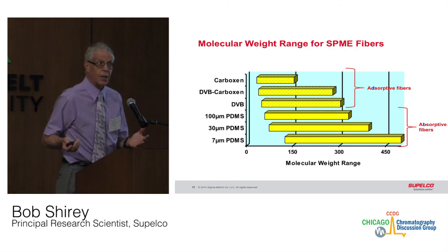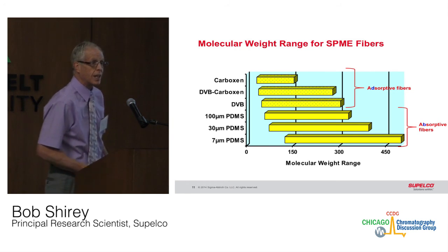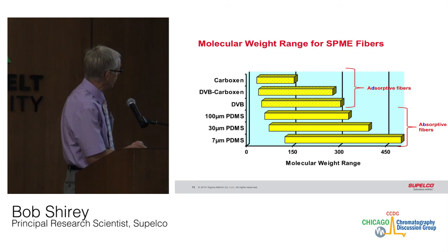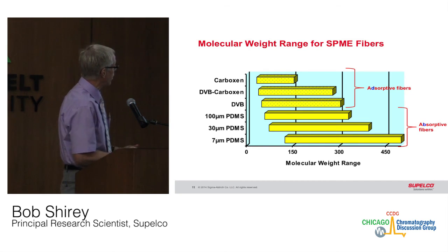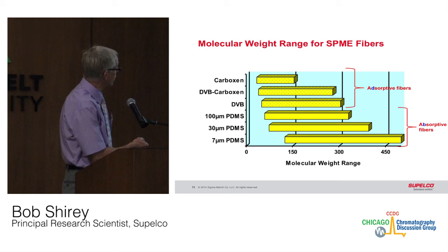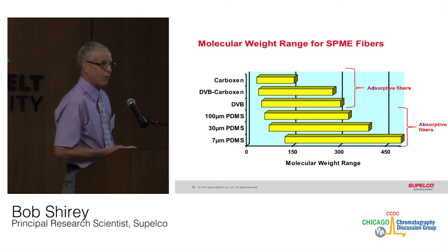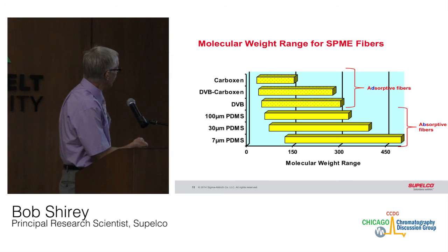Now, when selecting a fiber, I think the best way to do this is to look at the molecular weight range of the analytes. And this is a guideline of the molecular weight range for the various fiber coatings. This would probably be more of the optimum region. These can vary. It's not absolute, but they can be used as guidelines. Carboxen with small pores traps small analytes and can extract down to about 35. But once you get above 150, the analytes do not come off the fiber coating very well. And in fact, they come off so slowly that you don't see a distinct peak.